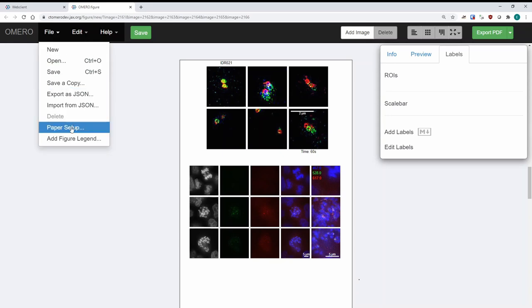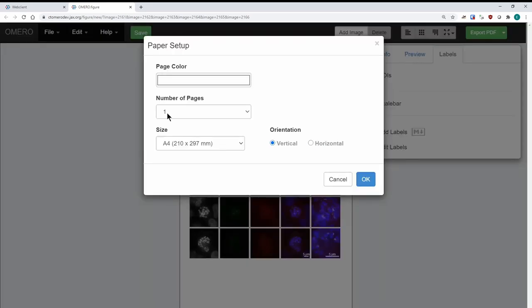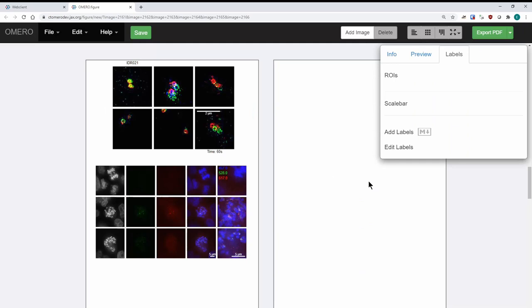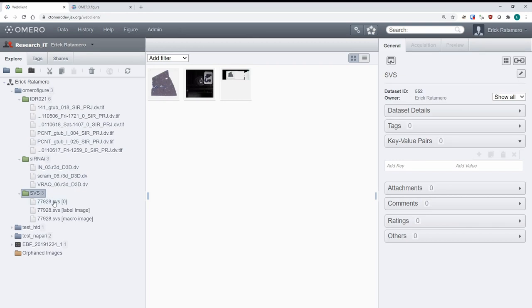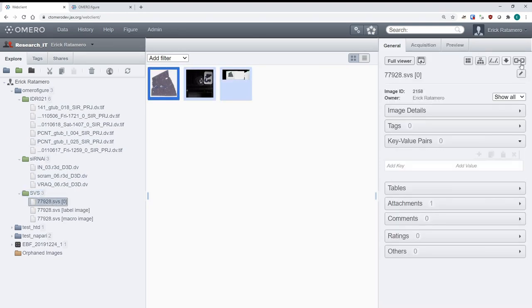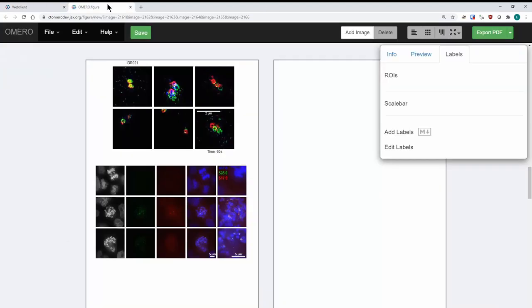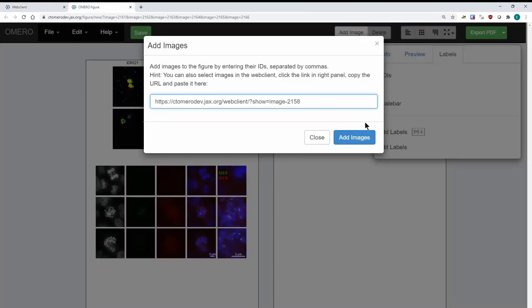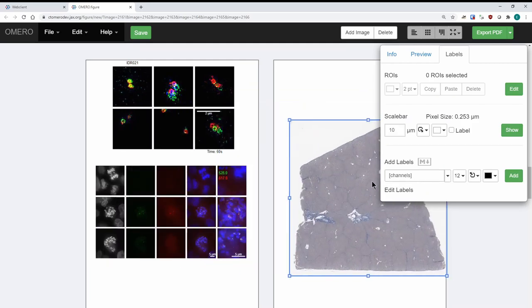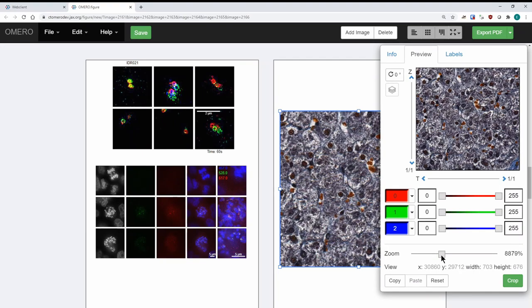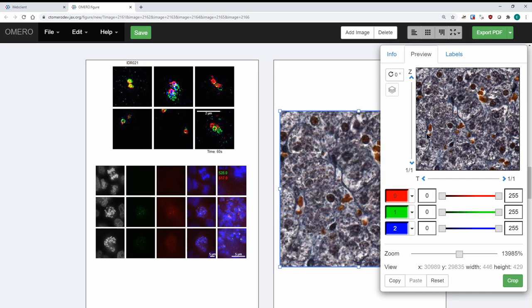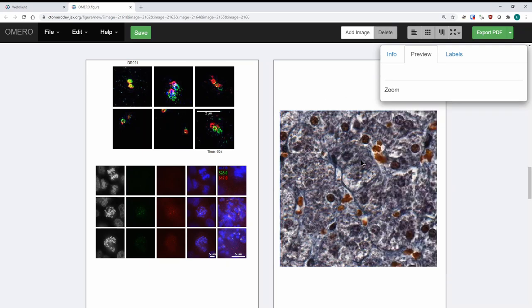The last thing I'm going to show you is paper setup. You can go to File > Paper Setup and I can increase the number of pages in this figure by one, so now I have two pages. I'm going to add one extra image on this second page — I'll go to another dataset, copy the link to this one image, and do the same thing: Add Image, paste. This is a really big image, so I'm going to zoom into one specific part to make it less work for the computer to render. You have RGB as the three channels, and you've added an extra image to your figure.